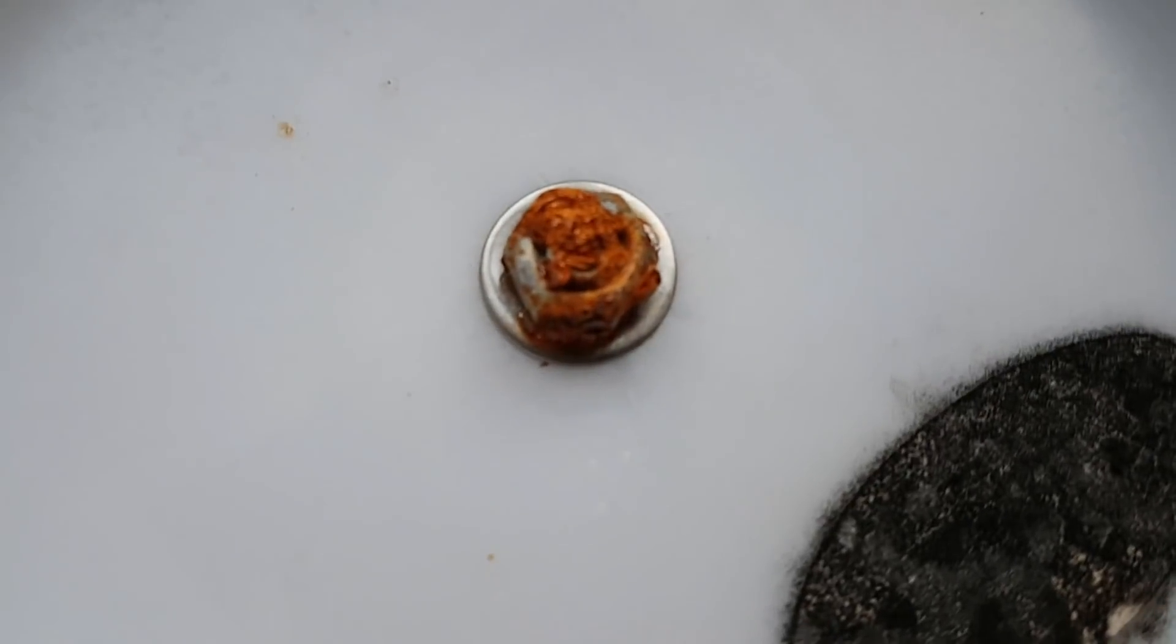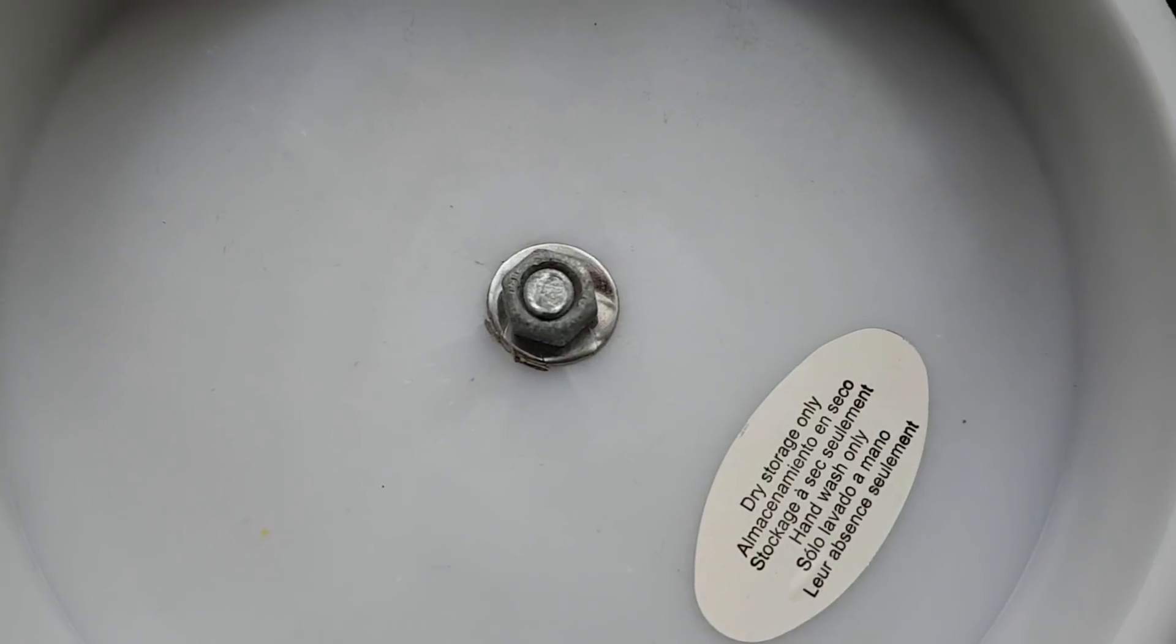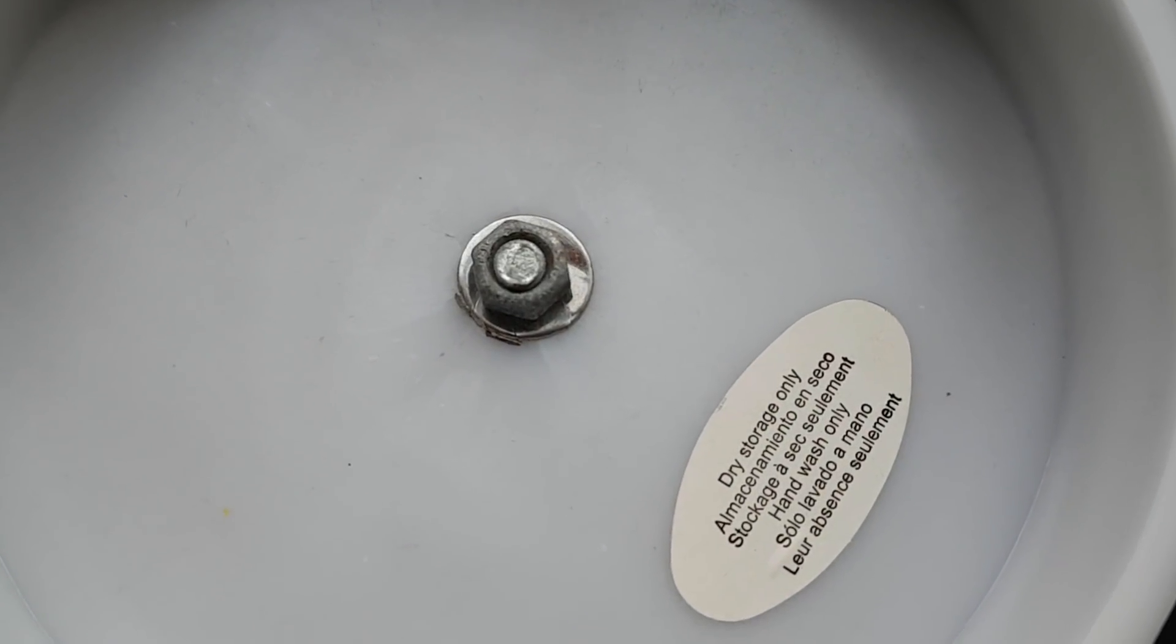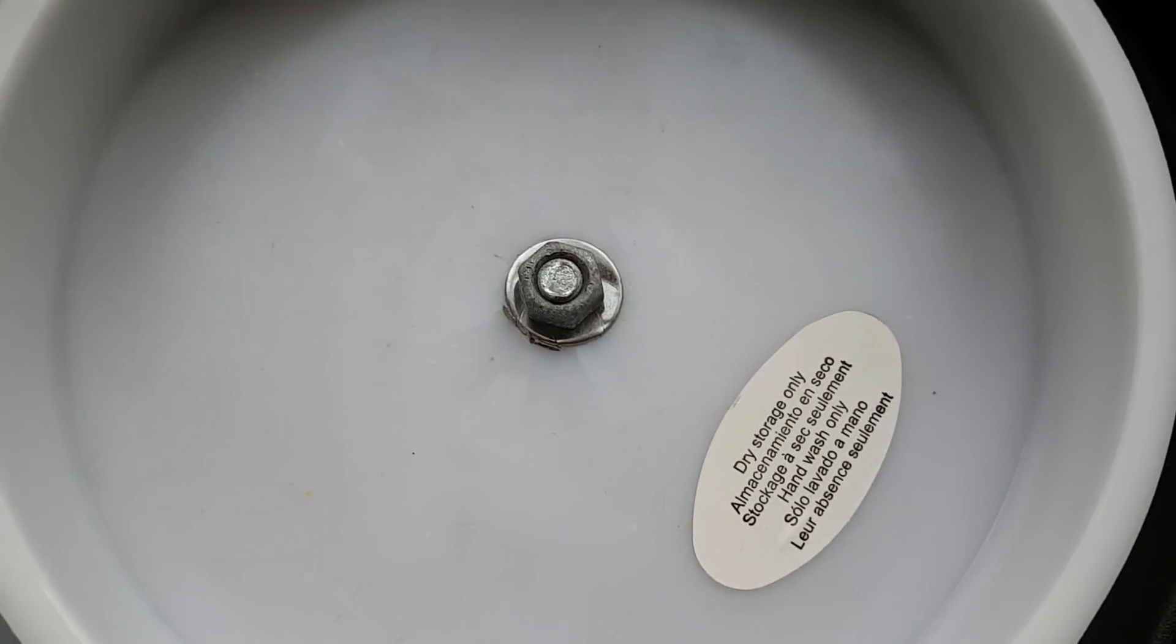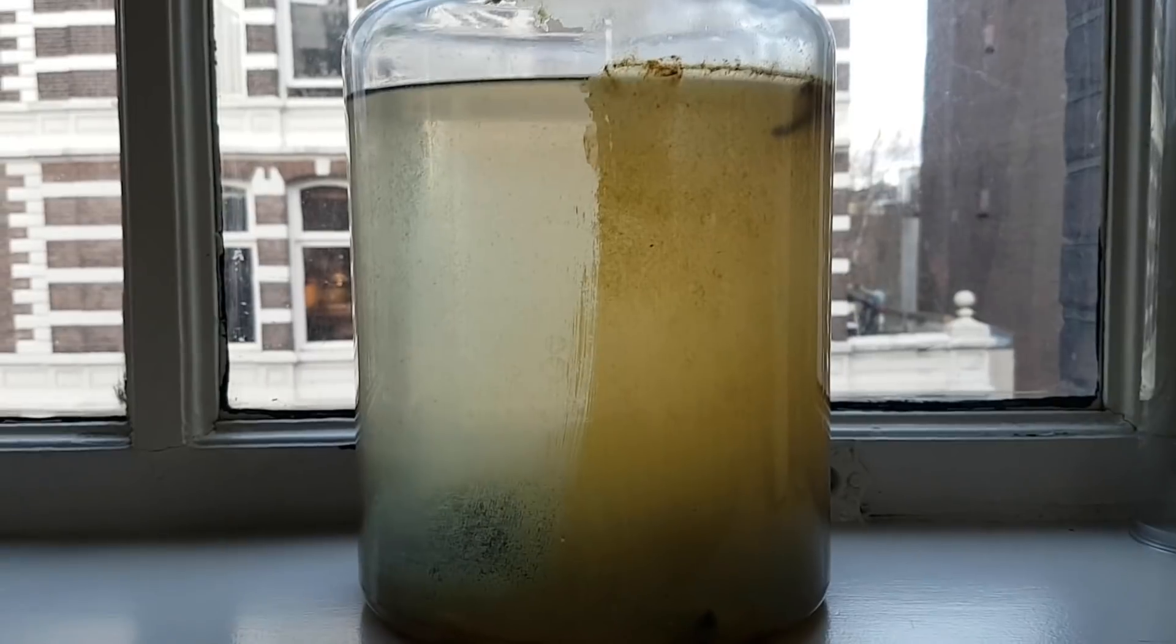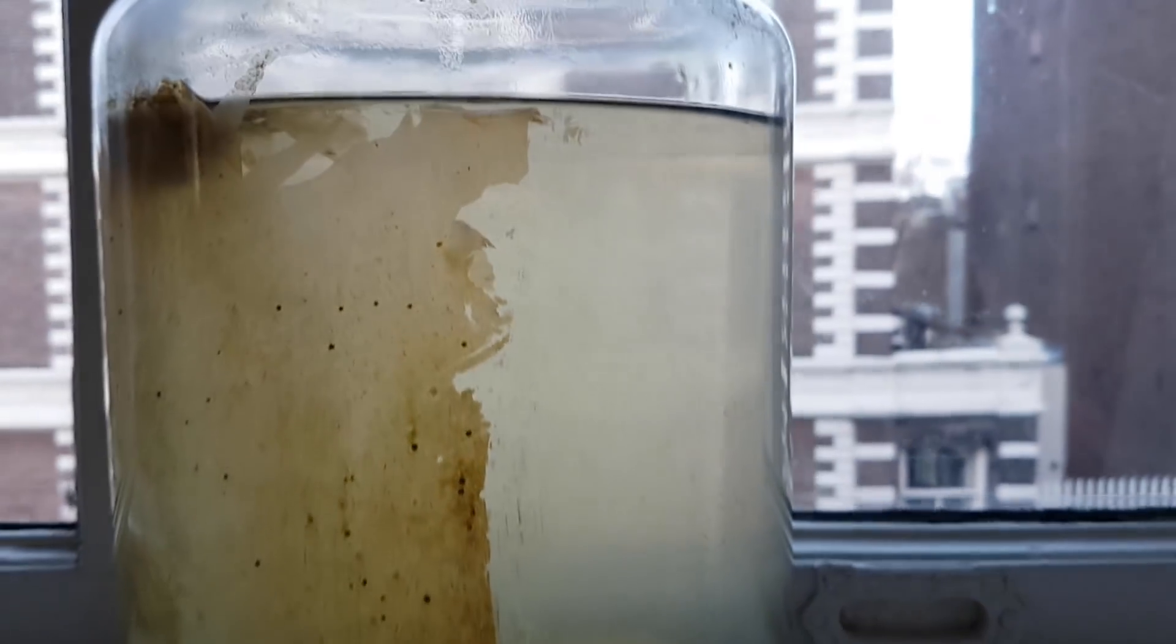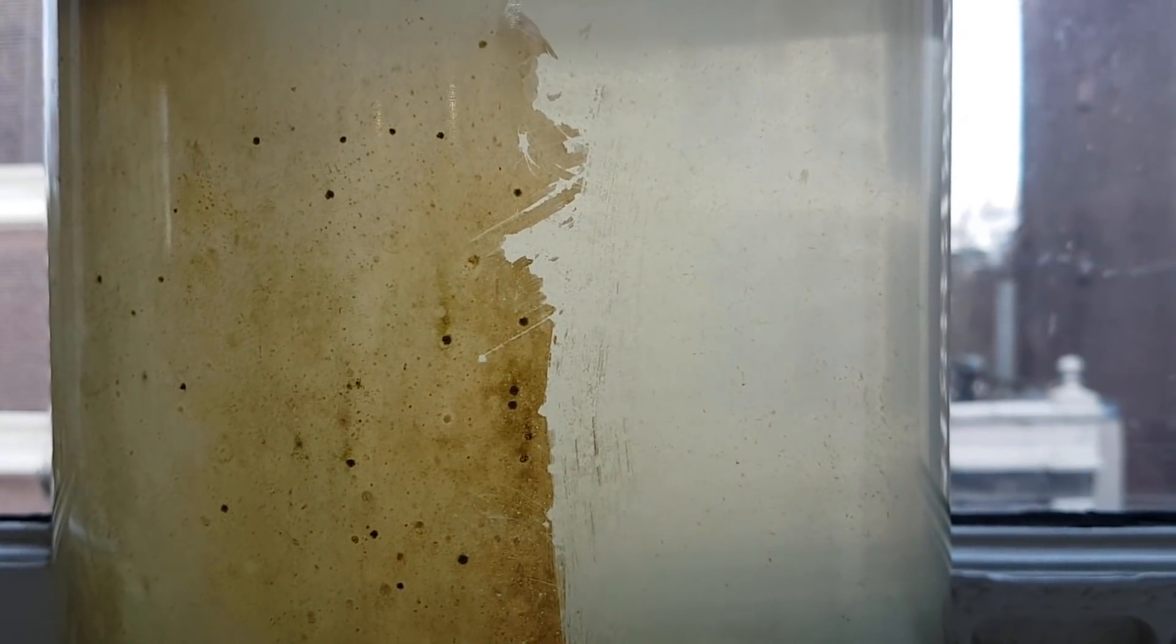This would happen if we tried to zoom in digitally. Not good. This is also fun to show you. This is what the lid looks like and this is what a normal lid looks like. I understand the rust, but I wonder what happened to the sticker. I decided to only clean half of the glass, so we can see what happens to both the clean and algae part when I let it sit open for some more time, making sure to add water to keep the salinity equal.